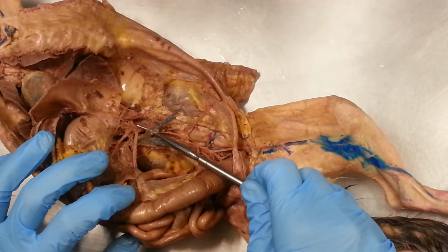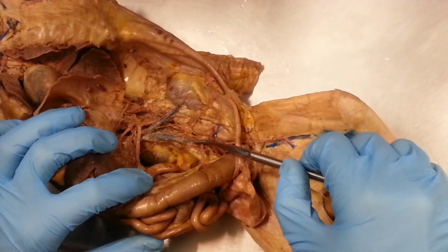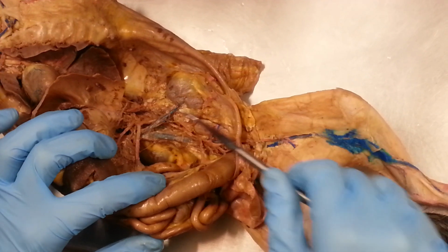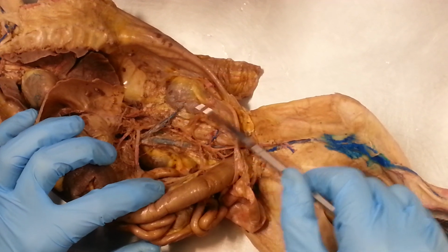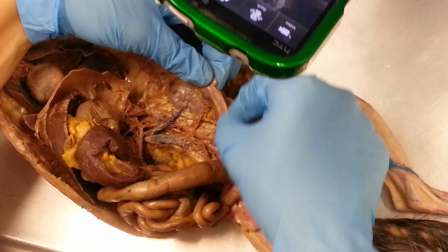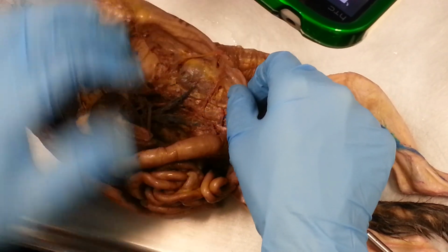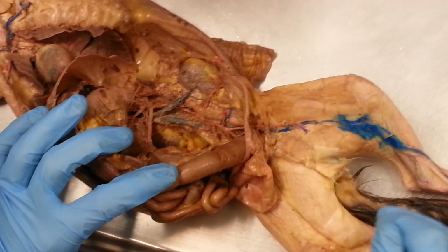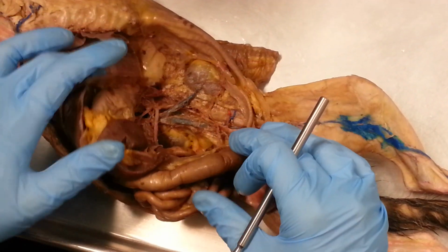The only thing that we passed by were my renal and gonadal. So in between my superior and inferior mesenteric, I've got two sets of arms here. One's going directly to the kidneys, that's renal. One's going directly to the ovaries, because this is a female cat. This is what my ovary looks like, and this is what my uterus looks like. This is my gonadal artery, okay? More specifically, it's my ovarian artery. Whether I'm talking about boy or girl cat, it's gonadal. If it's a girl, then it's ovarian. If it's a boy, then it would be testicular, okay?